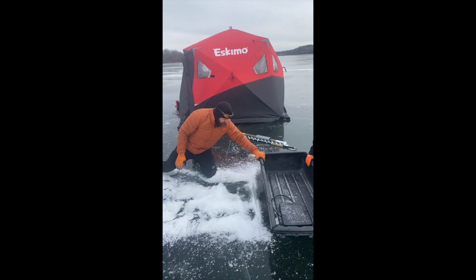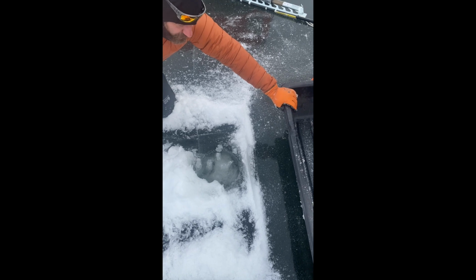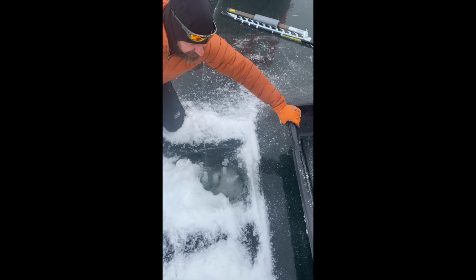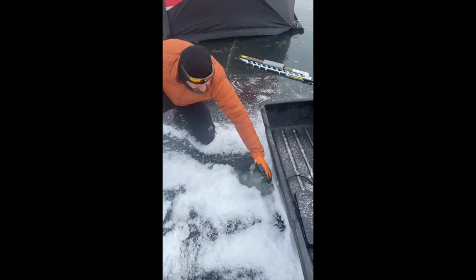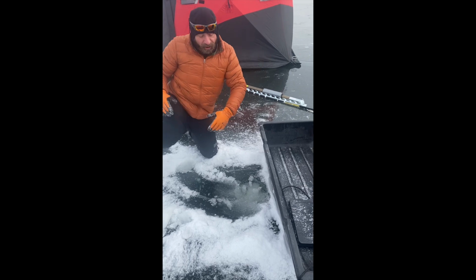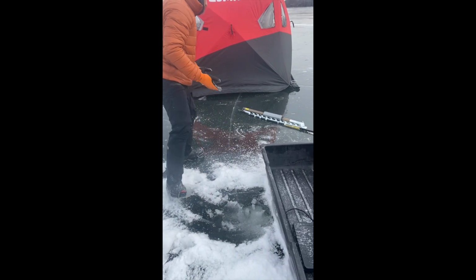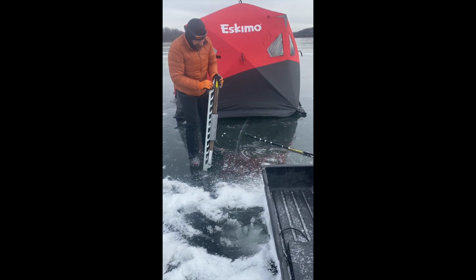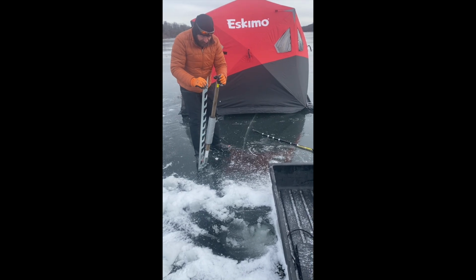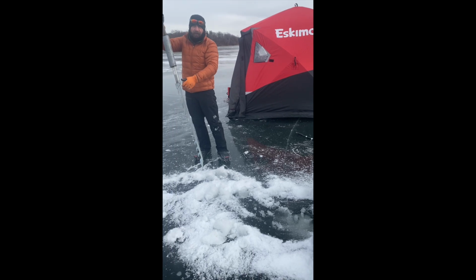So as you can see, mostly worked. The ice is pretty much undisturbed. This is not quite large enough for us to fit our Licor light meter, so we're actually going to make the hole a little bit bigger using a saw. And while we do that, we're going to be able to actually get a little chunk of the ice that we'll remove to record any observations about ice quality, and also get a nice precise measurement of ice thickness, and take a photograph of the ice.